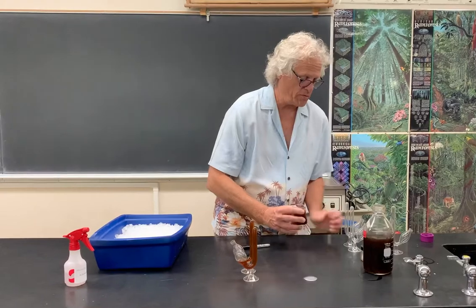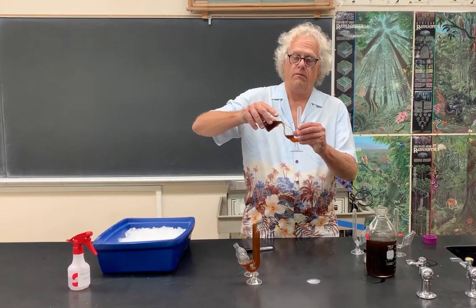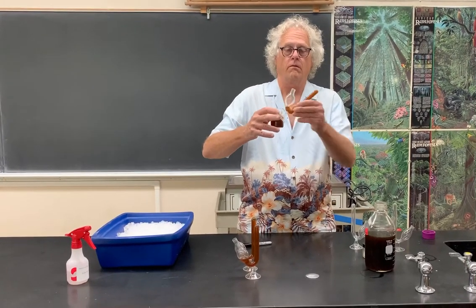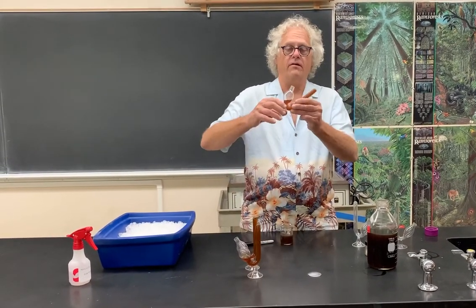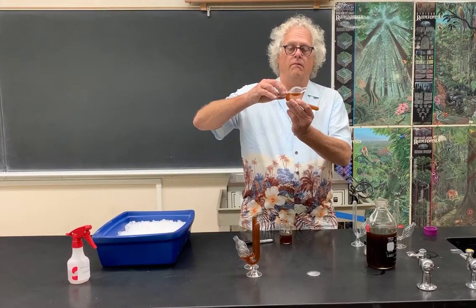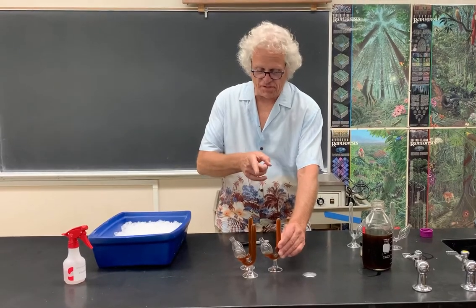There's 1, 2, I'm going to make a 3rd one here. A little bit of an air bubble in that one. I'll rock it back and forth one more time. Now I have 3 of them. I'll deal with them in just a second.